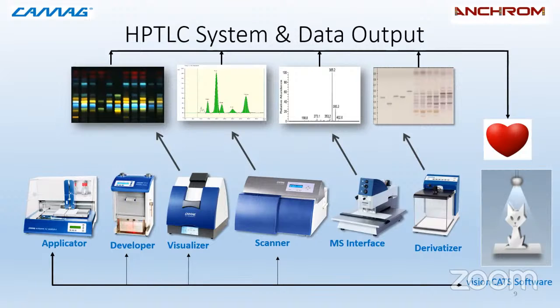Now we can connect HPTLC with the mass analyzer by means of an MS interface, and we can go for derivatization as well. We are going to see in detail about each of these instruments, and this is the data output which you get from each of these instruments. Then we have this VisionCAT software, which is the latest one, which controls all these instruments or which manages the workflow of your analysis.